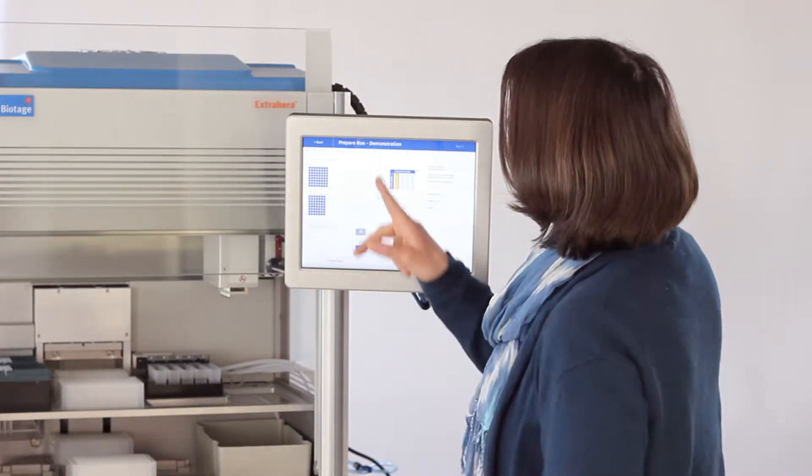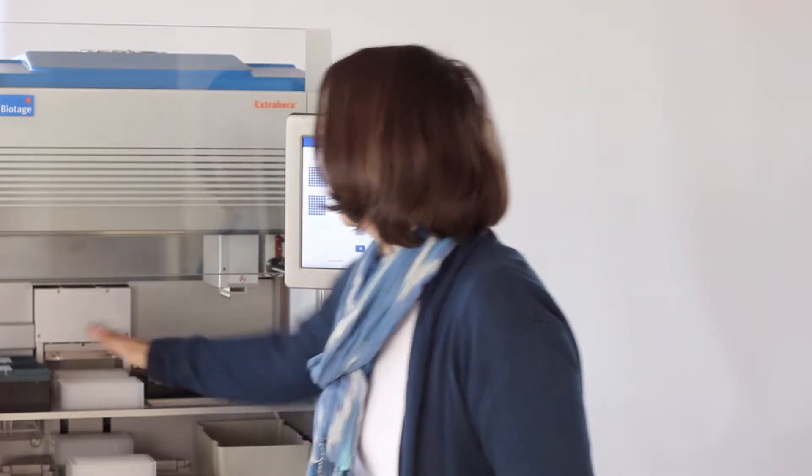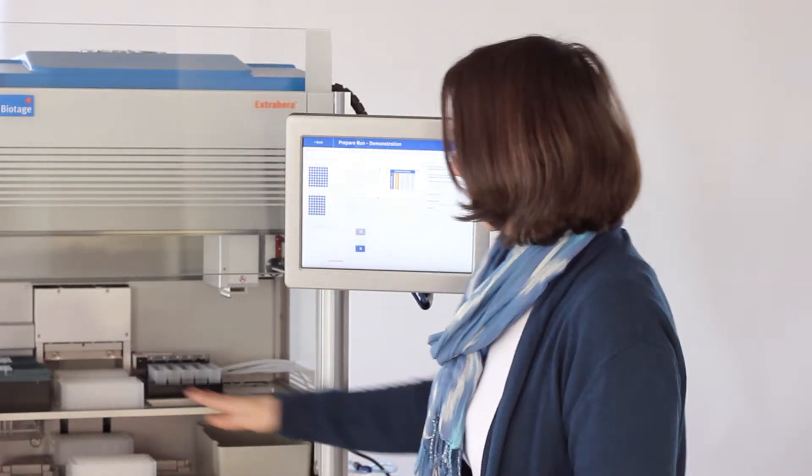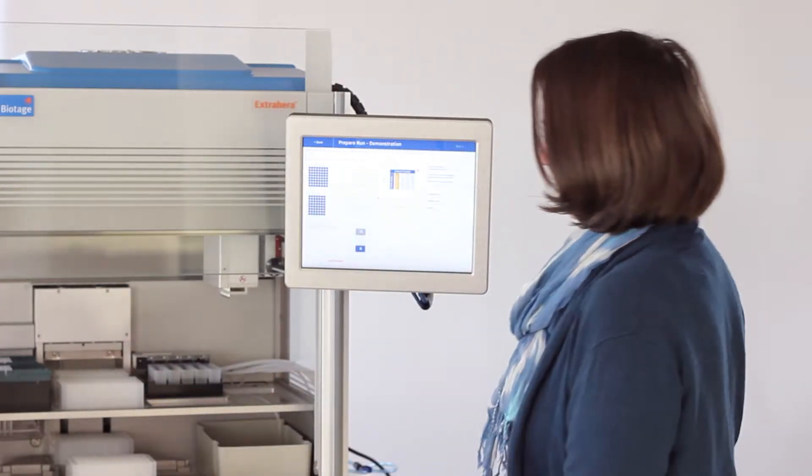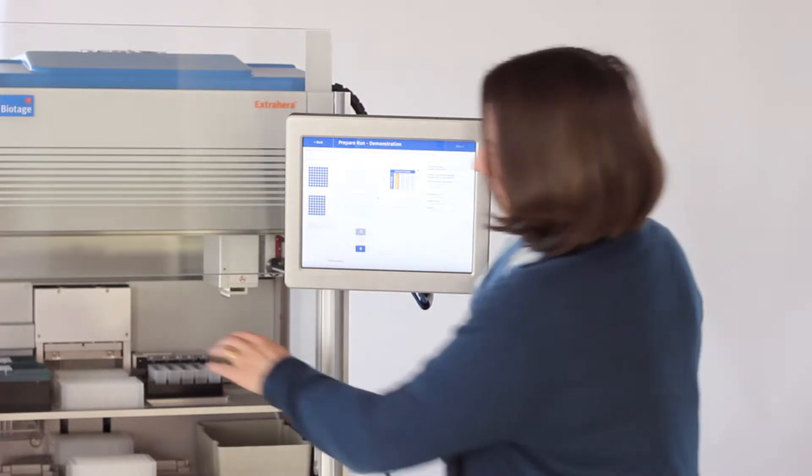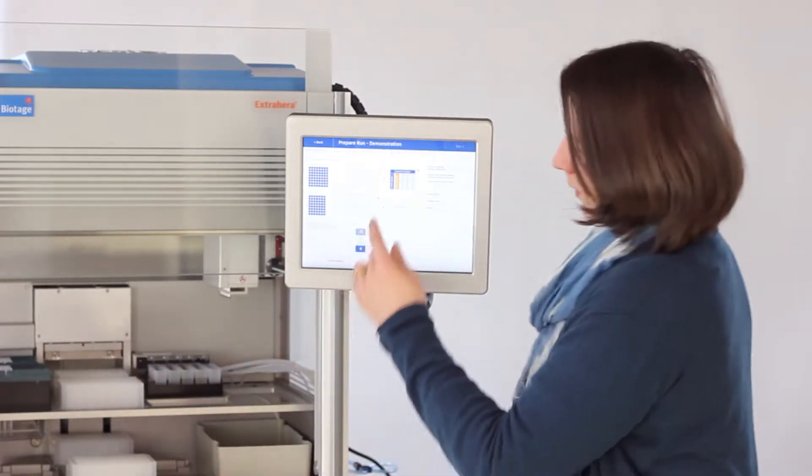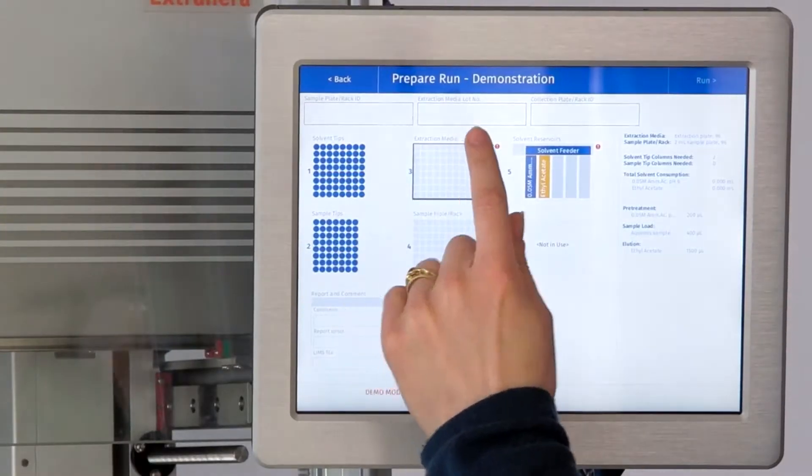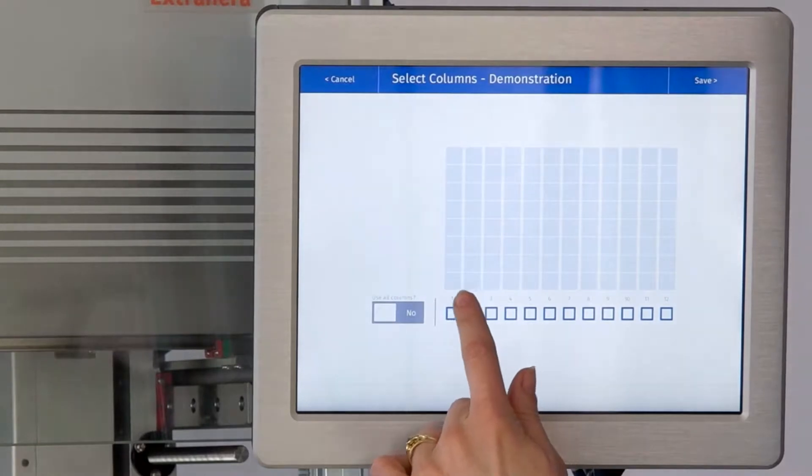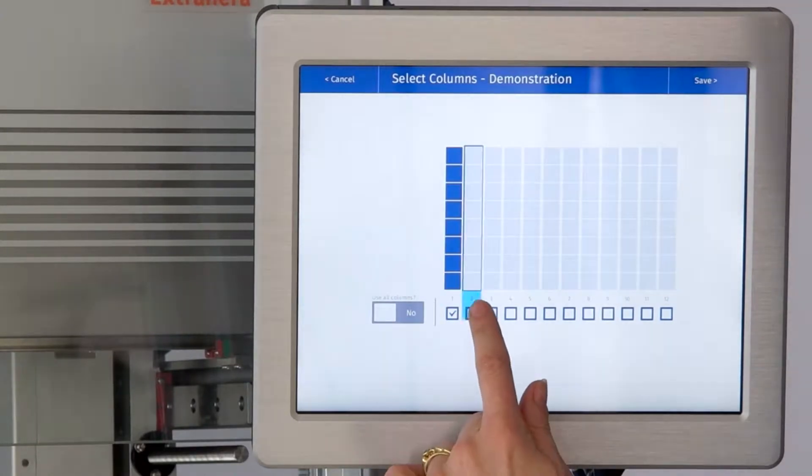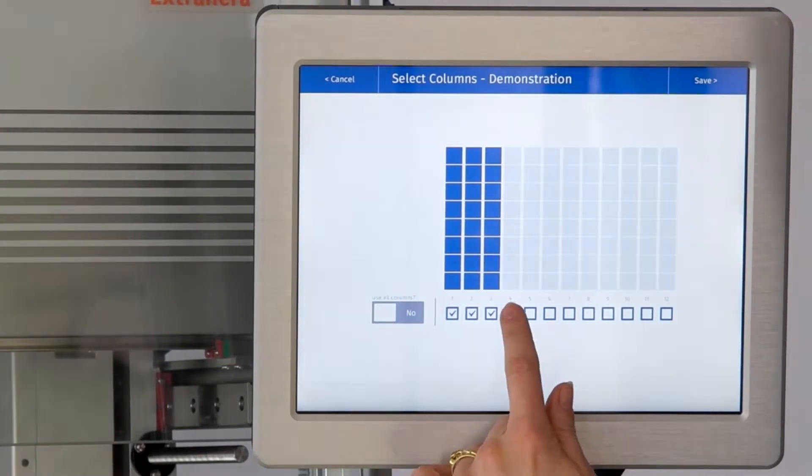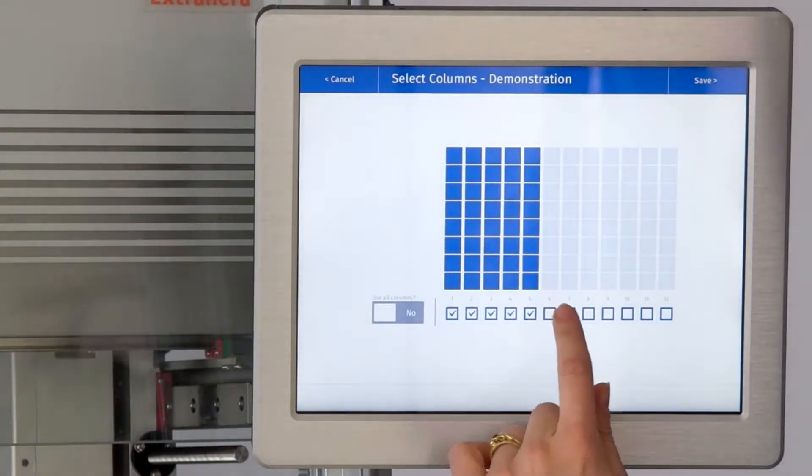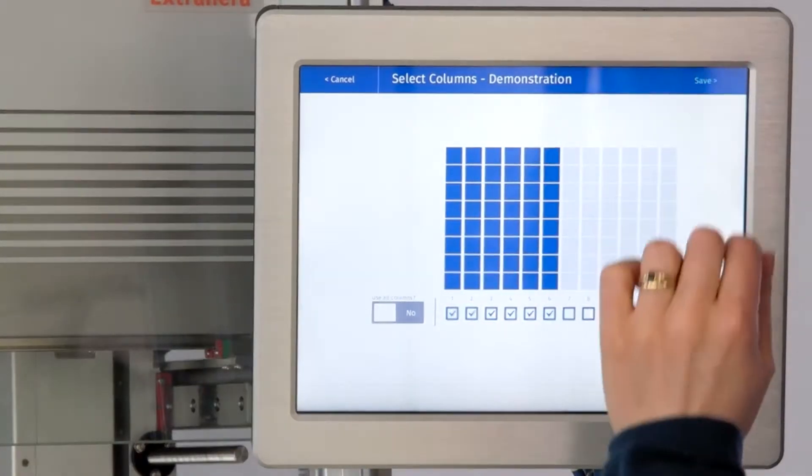Then we have to make sure we have our extraction plate in place and our sample plate in place. These two plates work together, so the columns that you pick on your extraction media are the same as the ones you'll pick from your sample plate. We'll run half a plate here.